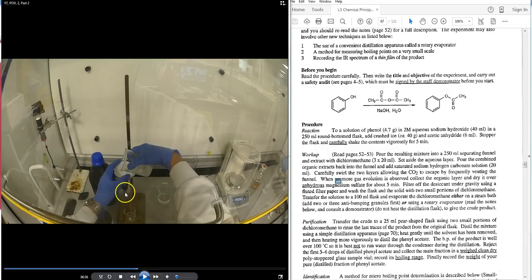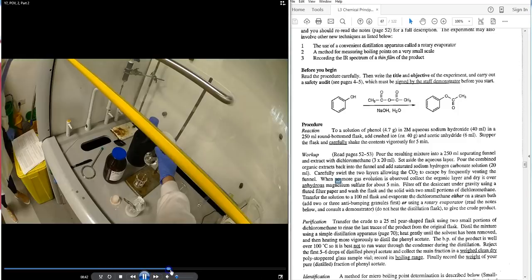The round bottom flask is pre-weighed and clamped into position. A fluted filter paper is placed in the filter funnel, the dried solution is poured in, and the beaker and funnel are washed with some DCM to collect all the magnesium sulfate residue. The filtrate is collected into the flask.